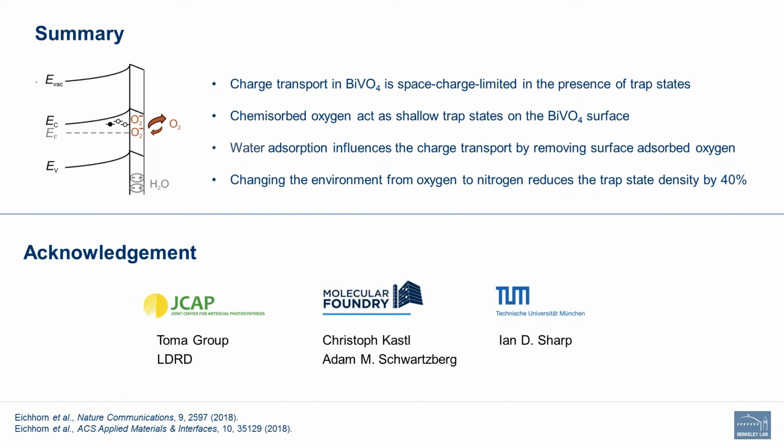We could potentially do something like this potential sensing. But that's something we would have to do maybe in the dark to begin with, because in the dark the dissolution of the BiVO4 is significantly reduced, so doing such measurements in the dark would be a good starting point.